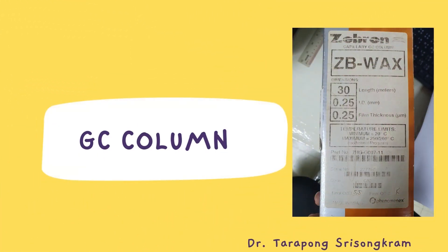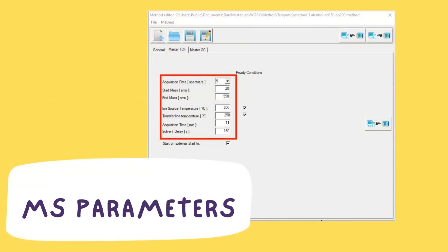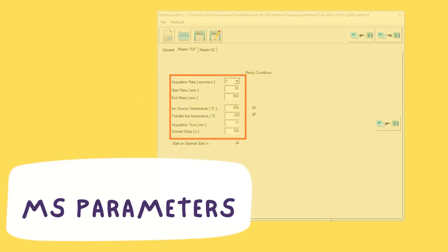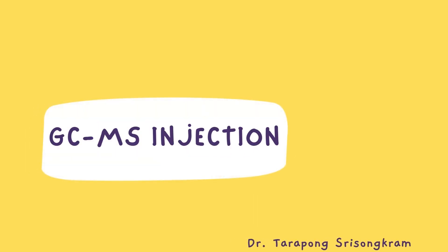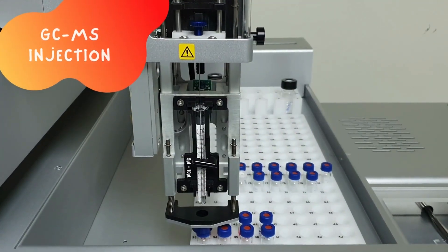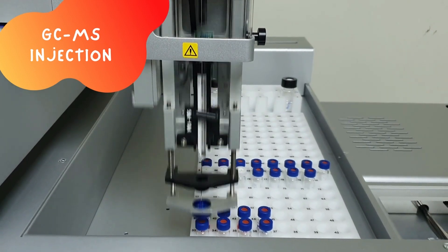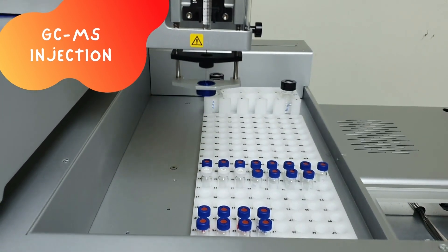Before injection, we need to connect the columns and set the GCMS parameters. Here are the parameters that we will use today. After setting the parameters, we need to tune the GCMS and wait for it to be ready.